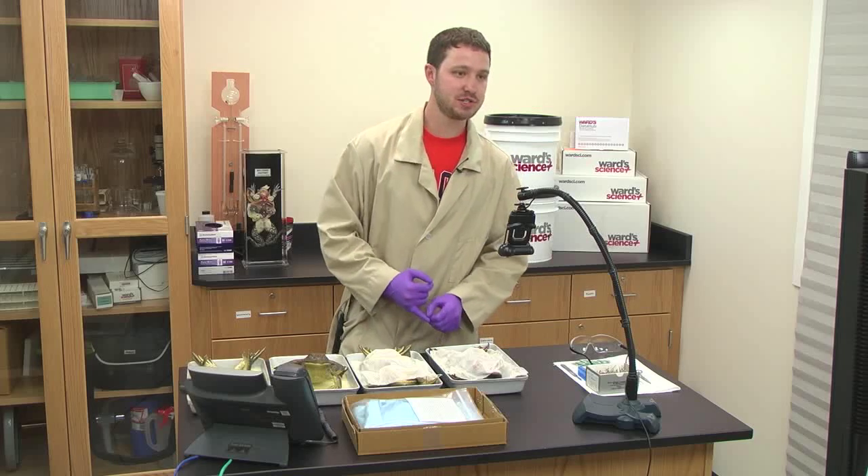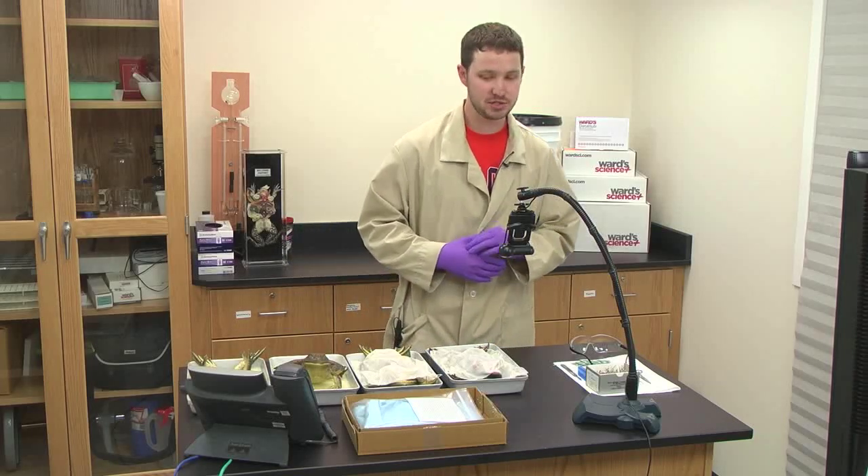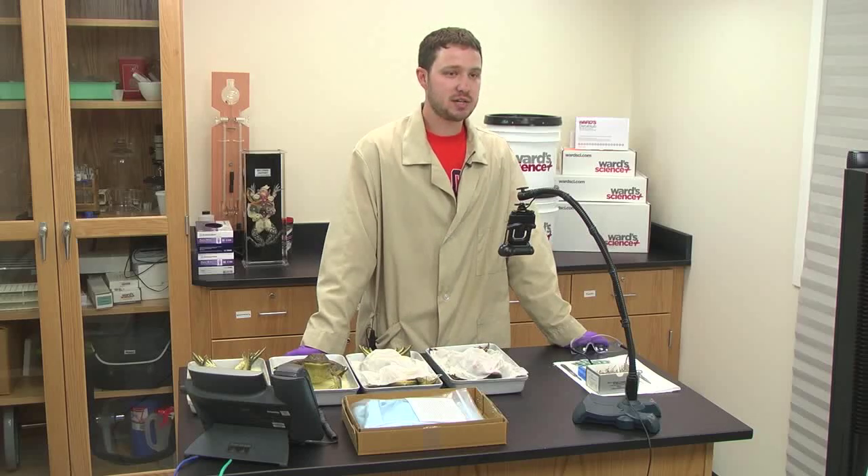My name is Nick Rossi. I am a preserved materials technician. I come to you with a BS in biology from St. John Fisher College. I've been at Ward's Natural Science for just about three and a half years now, and that entire time I've worked in the preserved materials lab.